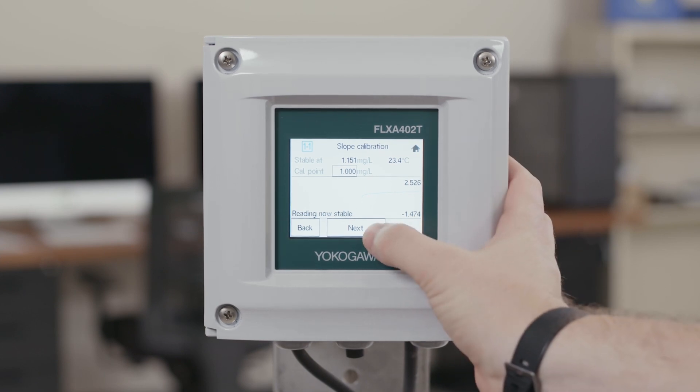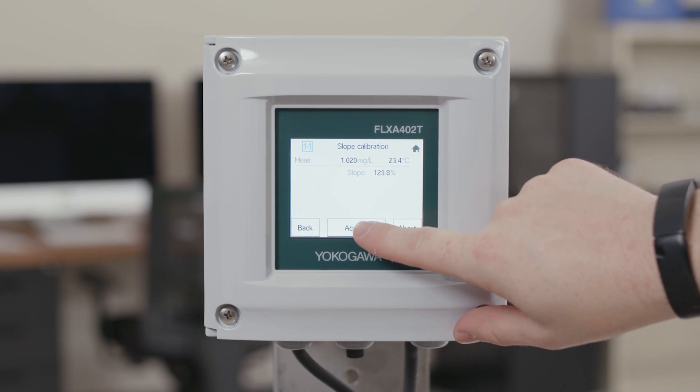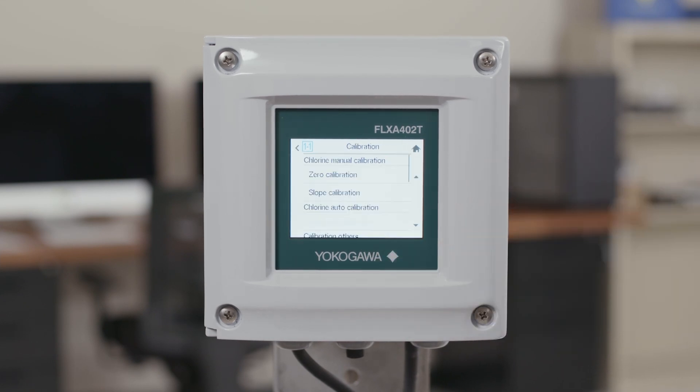Once you've done this you go ahead and click next and it'll calculate the slope and go to the next screen where it will show you your new current measurement value as well as your new slope. If this value looks right then go ahead and hit accept. If not you can try the calibration again or cancel the calibration. Once you hit accept this actually saves the calibration data into the analyzer and you're good to start your measurement again.